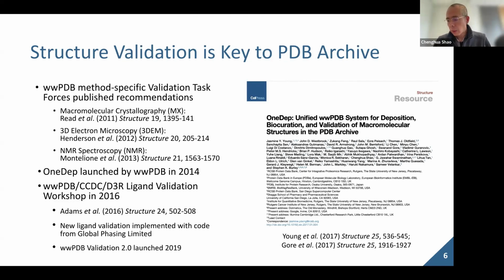Just like Stephen said, I want to reemphasize that PDB is not in the role of journal reference. We only review the structural quality and point out the possible issues to the authors, and it is ultimately up to the authors to decide what to do with the issues. For structures with significant issues, we'll add a caveat record. We'll also present the quality report to users so that users can review and decide what to do with the structure and which one to choose, which is the focus of today's webinar.